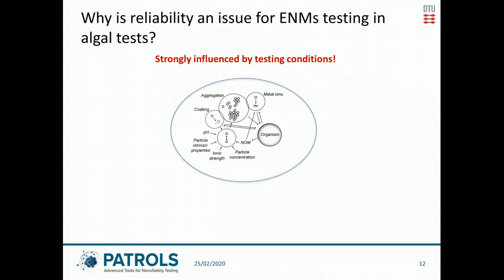We have long-standing experience in working with the algae test, and we have also contributed to both guidelines and standards in this area, and realized that it's really a lot to do with testing conditions if you want to make a good test.